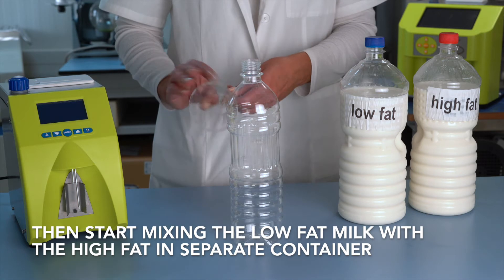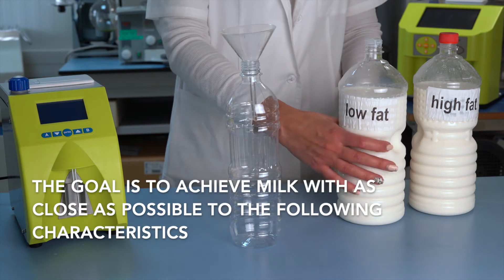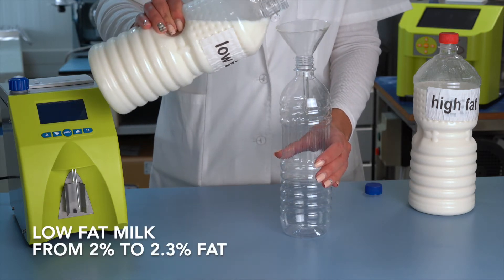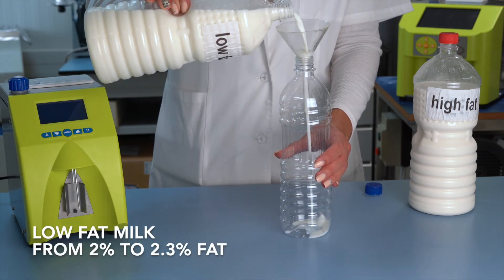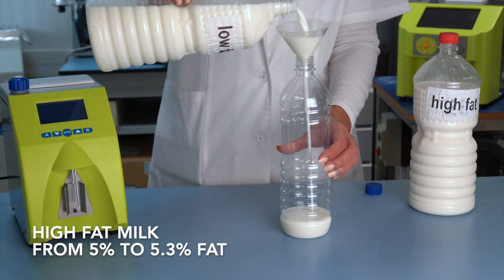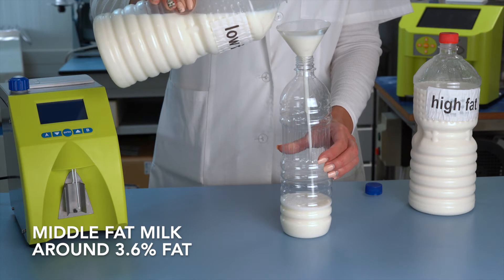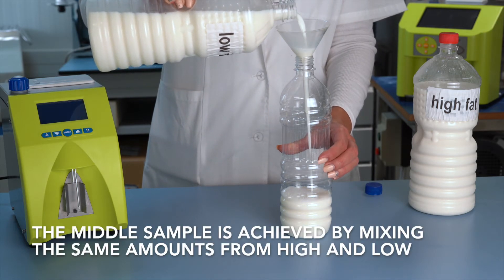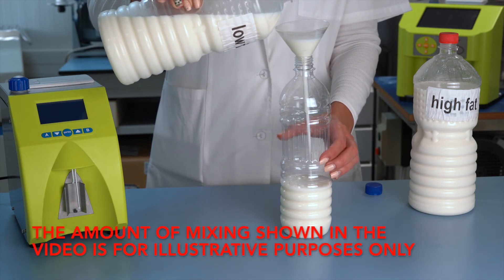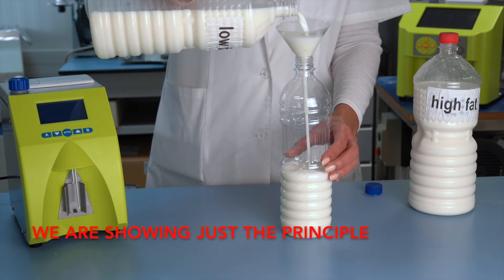Then start mixing the low-fat milk with the high-fat milk in a separate container. The goal is to achieve milk with characteristics as close as possible to the following: low-fat milk from 2% to 2.3% fat, high-fat milk from 5% to 5.3% fat, and middle-fat milk around 3.6% fat. The middle sample is achieved by mixing equal amounts of high and low. The amounts shown in the video are for illustrative purposes only — we are showing just the principle.